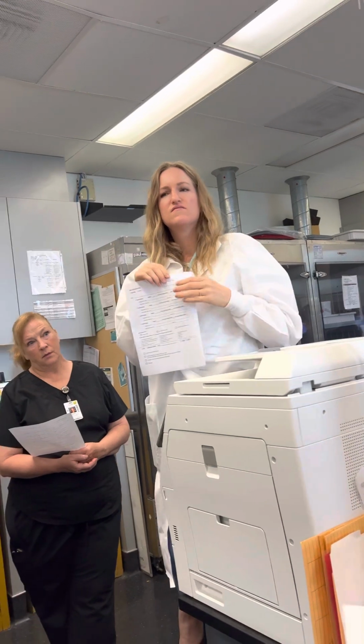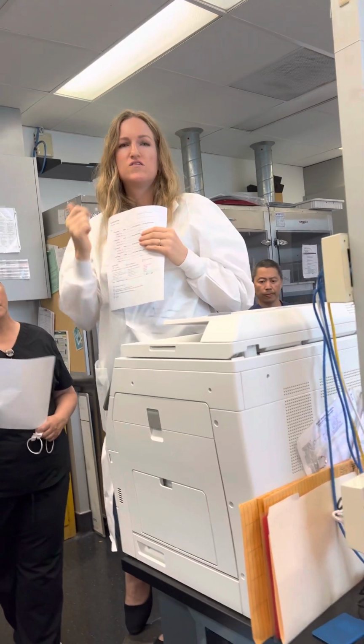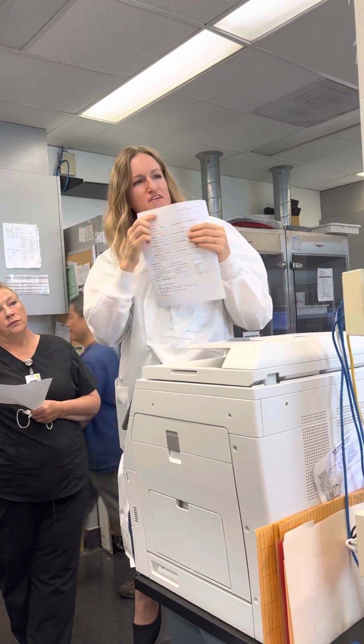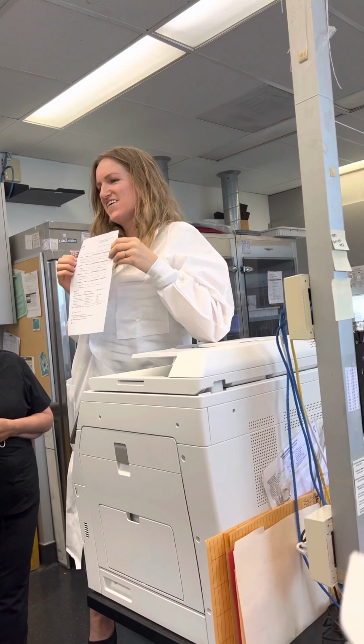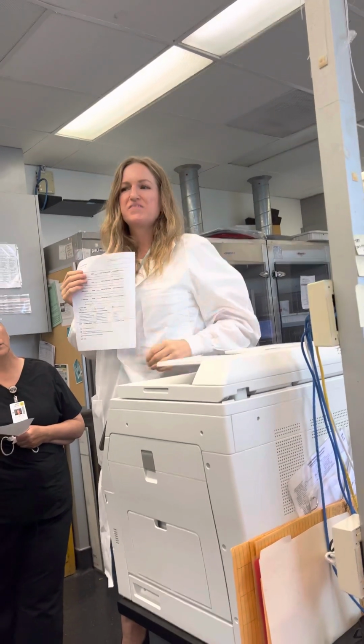And then on the container of the formalin, you would just write pass 2 through 4, whatever passes there were. Or cyto, or cyto. So this is the paper, tilting towards cyto or tilting towards formalin? Who knows? We're going to see a lot of both, I think. Yeah, lots of both. That is our wish.